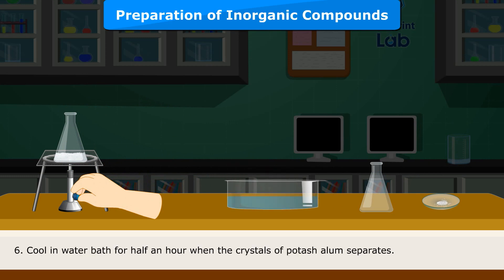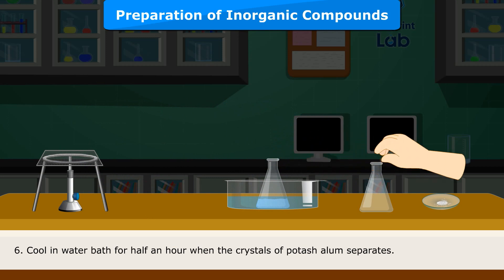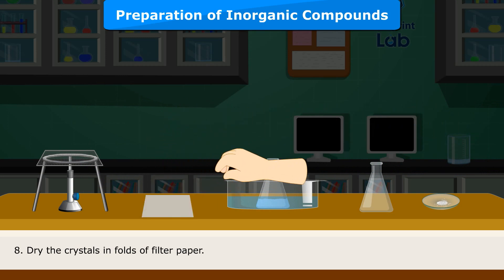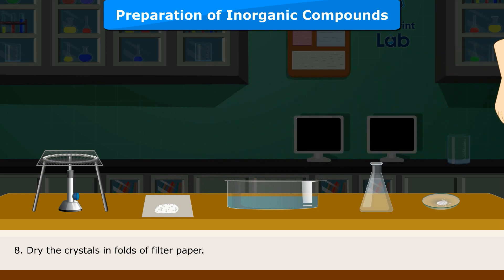Cool in a water bath for half an hour until the crystals of potash alum separate. Decant the mother liquor and dry the crystals in folds of filter paper. Weigh the crystals.